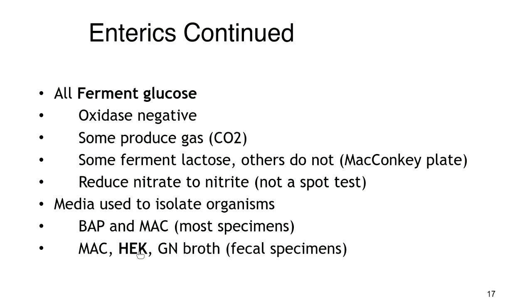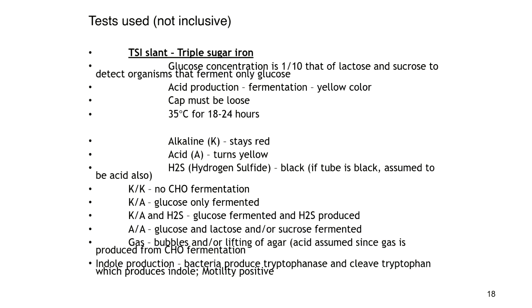HEK stands for hektoen enteric, HEK plate, okay? So enterics ferment glucose, and lactose is a type of sugar, and some do not ferment that. So that McConkey plate is a really nice one.